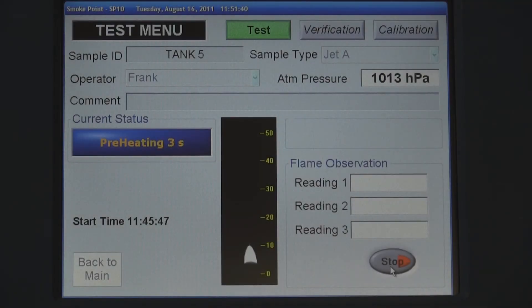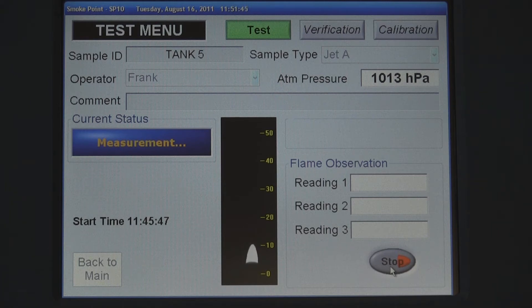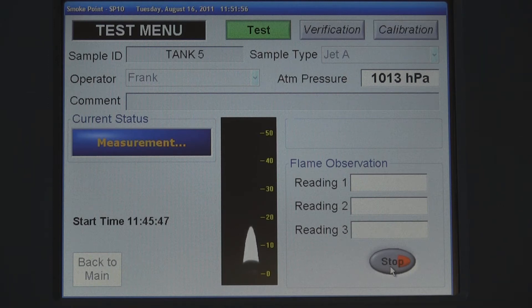After preheating, the test flame is adjusted using the camera and the test begins. Three individual measurements are performed and reported on screen in real time. The SP10 is an automated smoke point instrument that strictly follows ASTM D1322 while eliminating the subjectivity inherent to the manual test and significantly improving repeatability and reproducibility.